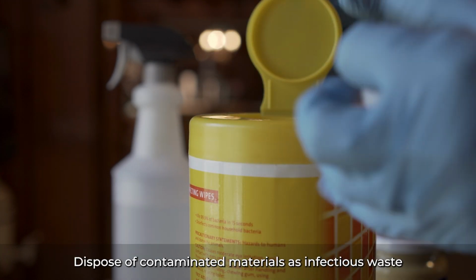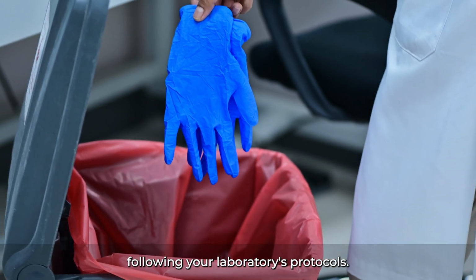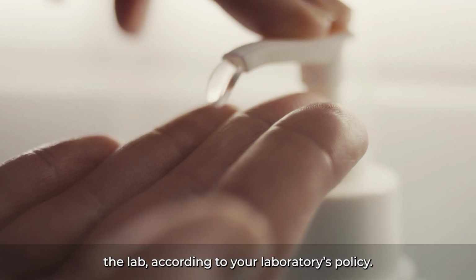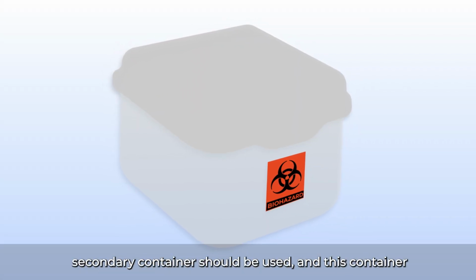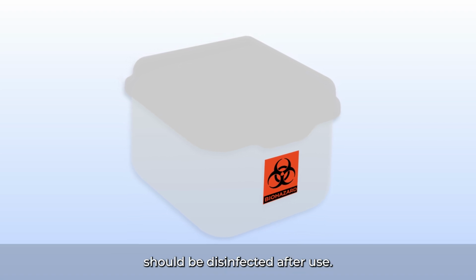Dispose of contaminated materials as infectious waste following your laboratory's protocols. Remove PPE and perform hand hygiene before leaving the lab, according to your laboratory's policy. Lastly, when transporting Candida auris, a sealable secondary container should be used, and this container should be disinfected after use.